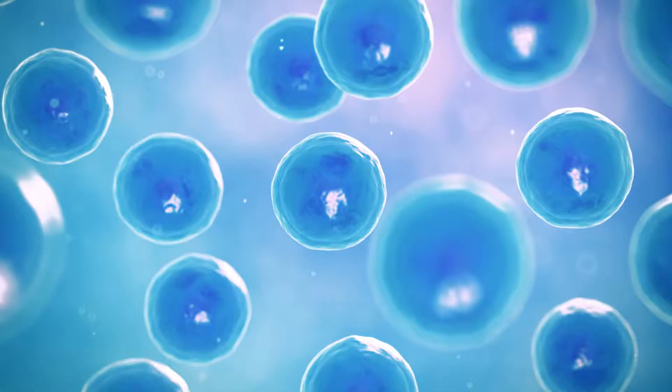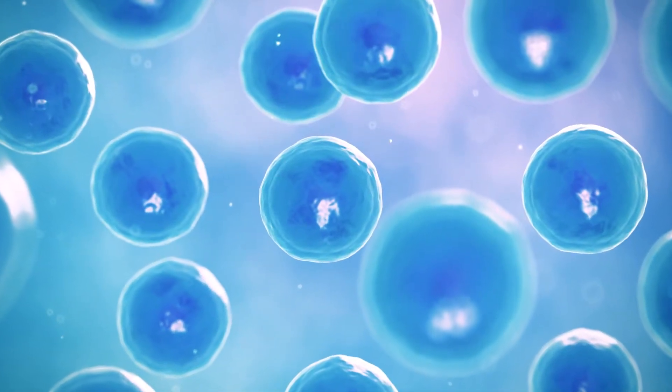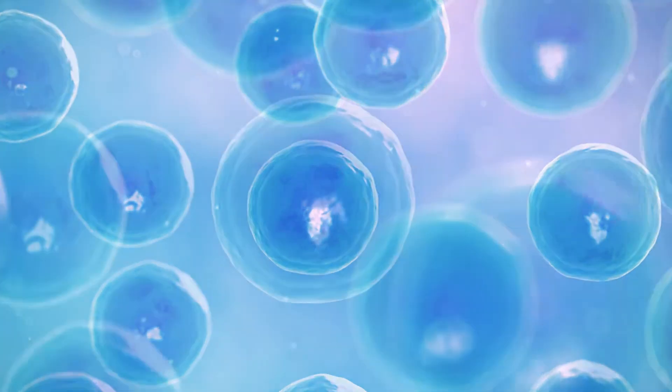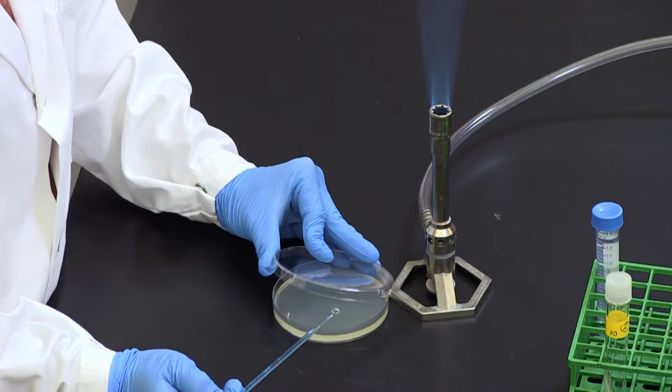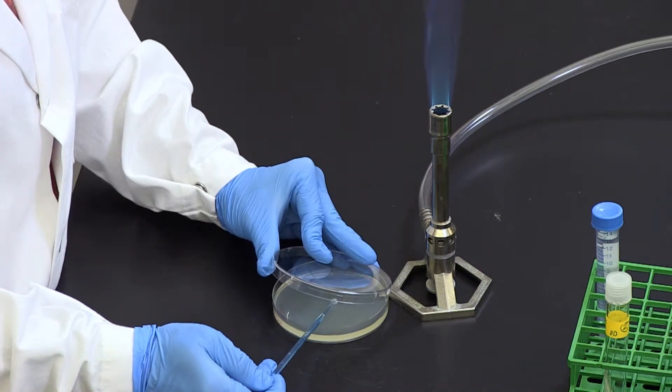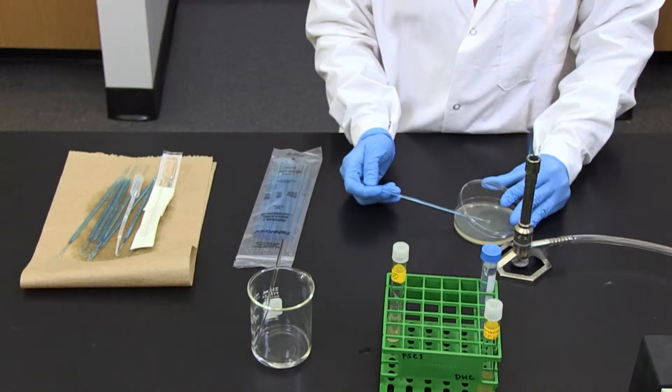Spread Plate Method. When the concentration of cells in a culture is small, or a highly selective media prevents all but a small number of cells in the culture from growing, less effort is needed to separate them from one another. A spread plate is a method for isolating such a culture.